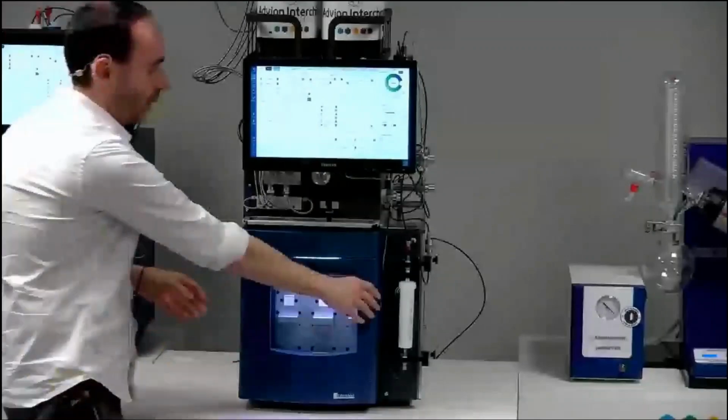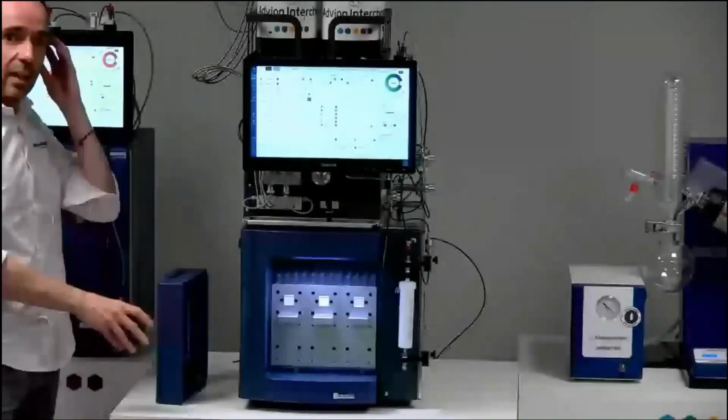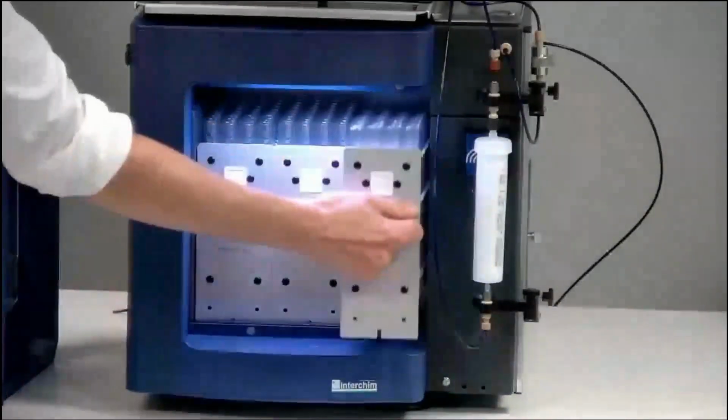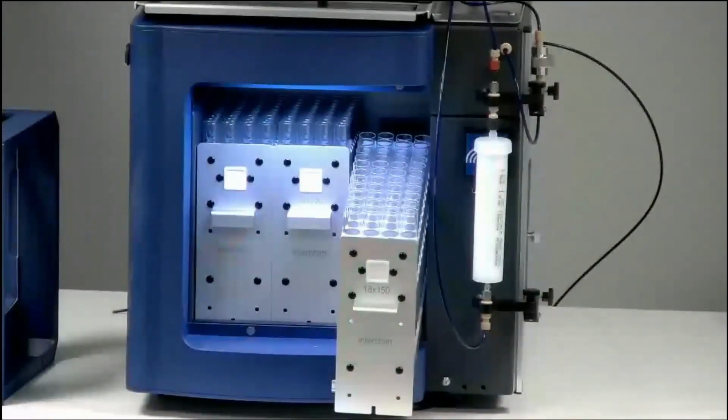So the fraction collector is just there. Inside we have 3 racks, and on these racks, for example, here we put 18 millimeter tubings, and we have 132 tubings for this size.